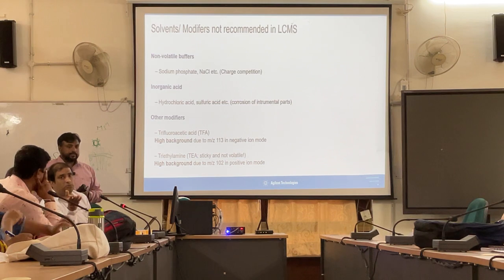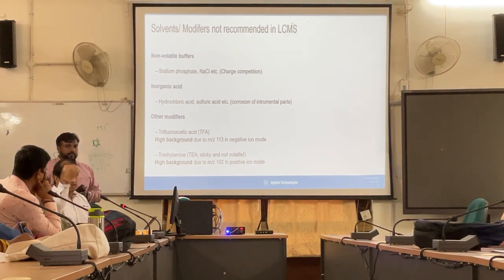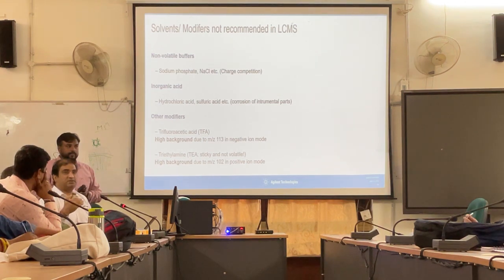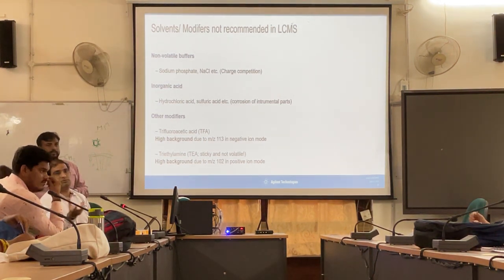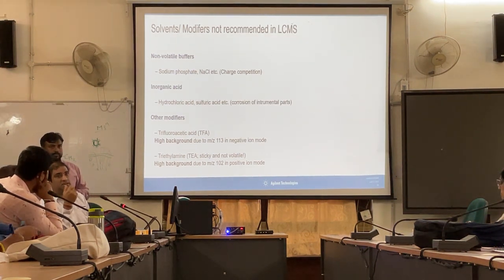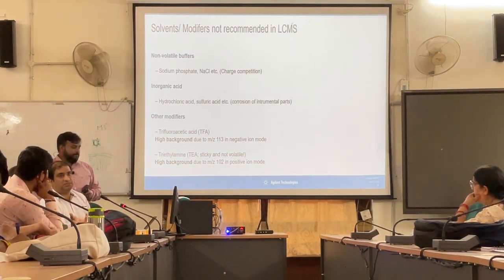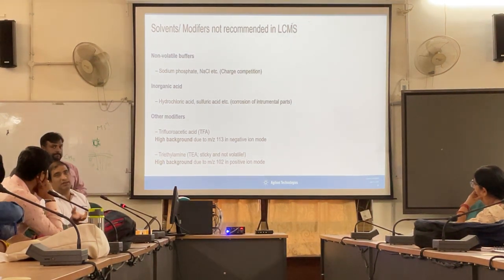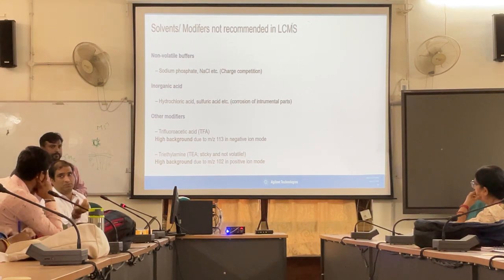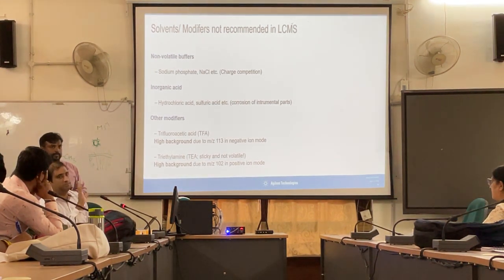Suppose we discussed plants, right? You saw the presentation from Palampur, IHBT. First they established that pesticides are not there, because it is difficult to get a plant without pesticide. You don't know what all things will be there in the field. Similarly, they established that there is no infection, because if there is infection from fungus or bacteria, the metabolites from the fungus and bacteria will show up. So you need to be careful about it. But whatever is there will come.